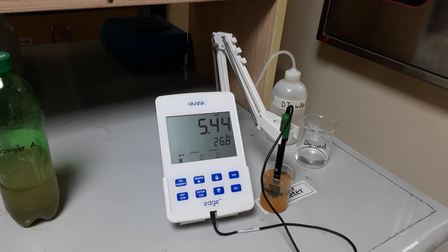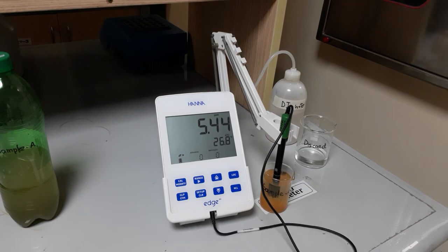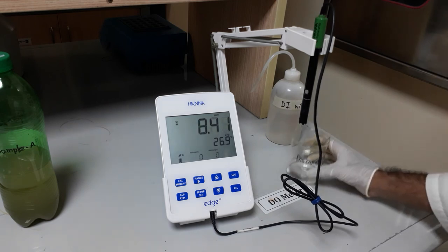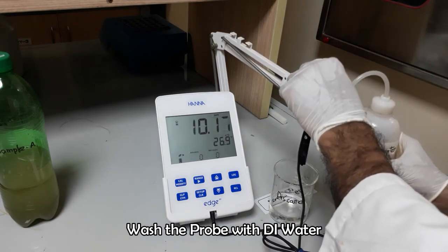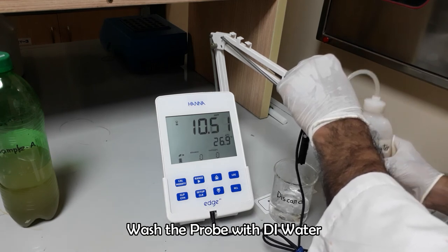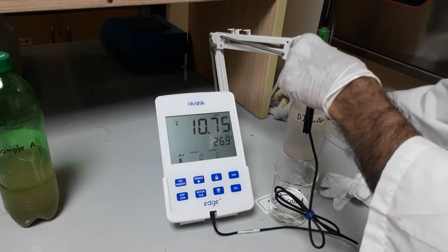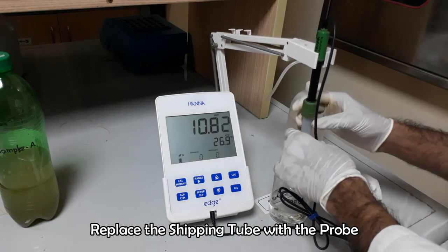This is the final reading showing in the display. So the DO of the sample tested in this experiment is 5.44 ppm. Wash the probe and use tissue paper to dry it. Replace the shipping cap and attach with the probe tightly. Clean the workstation.